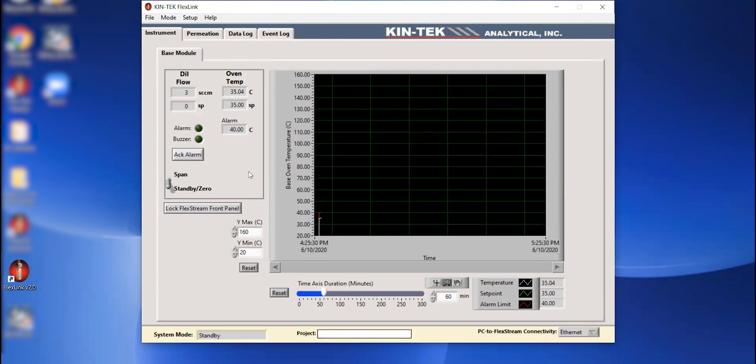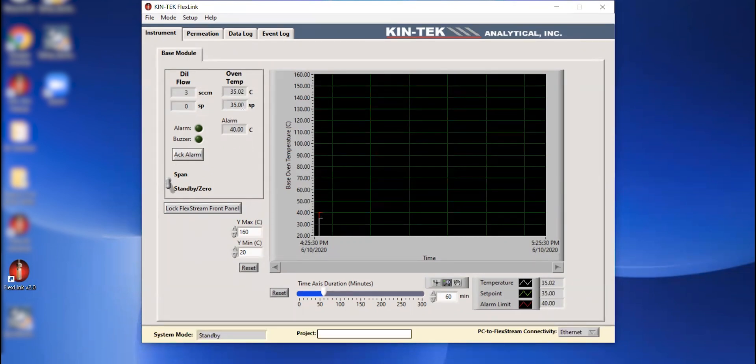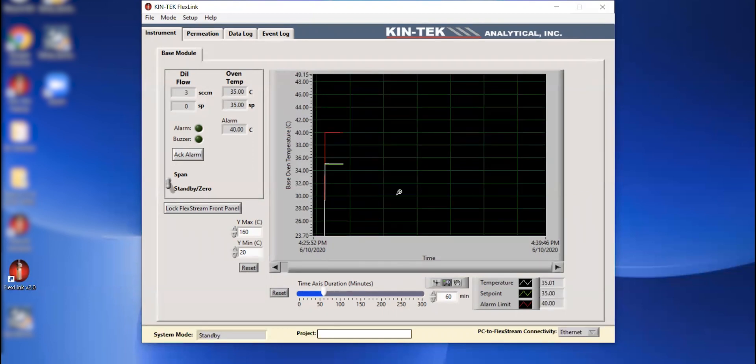Back to the software. So we've connected. We can see that we're communicating. We have a temperature set point of 35 degrees C here. And the oven is actually starting to stabilize at that 35 degrees C. Just to hone in on that for a second. So we have our set point of 35 degrees C, our alarm set point of 40 degrees C. We can see that these two lines here, this white line and this green line are converging. So that means we're getting really close to our set point. So everything's pretty much stabilizing.